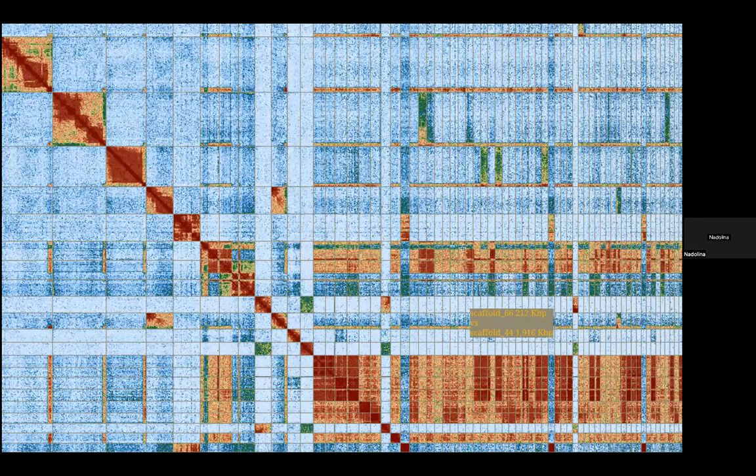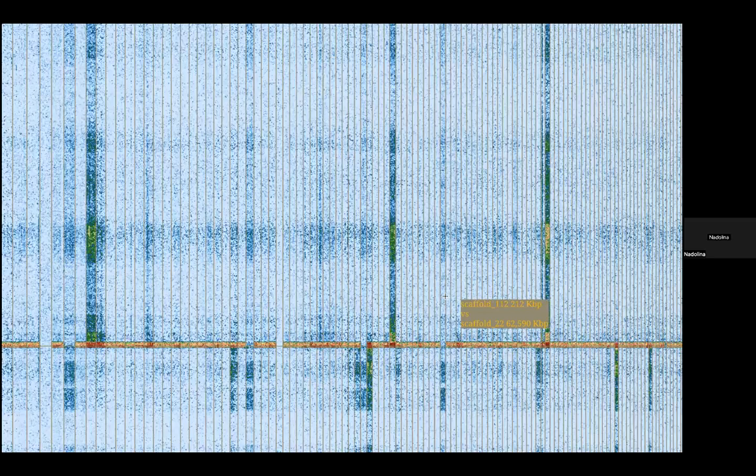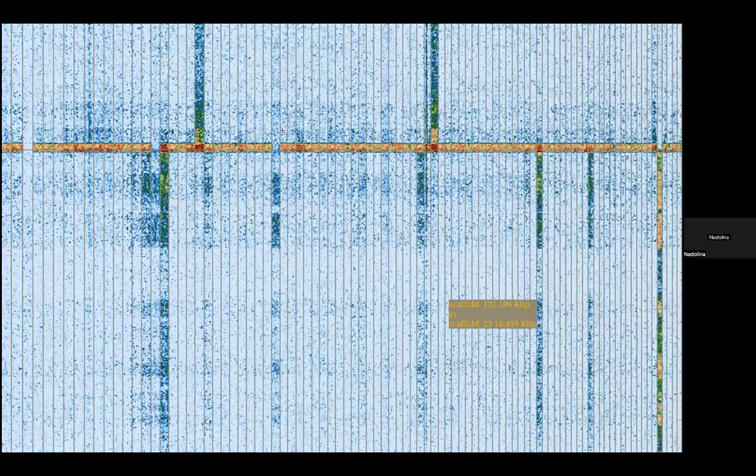So one good trick, because obviously there's a lot of signal along here. Like if you look along here, there's a lot of pieces that are showing pretty significant signal that can all be assembled. But one good trick to make that easier on yourself, so you're not zooming in and out constantly, is to try and actually move these shrapnel pieces together and sort of block them up.